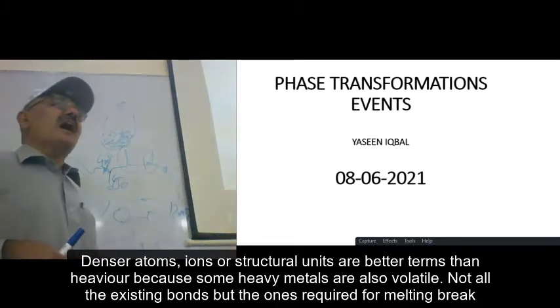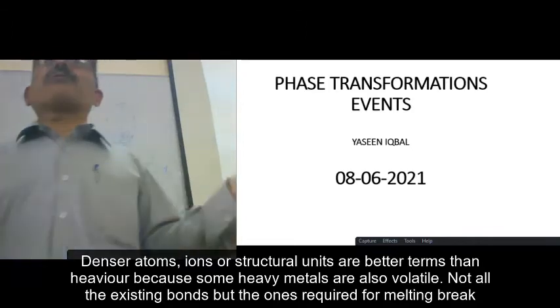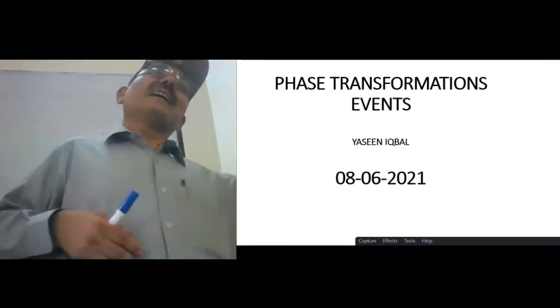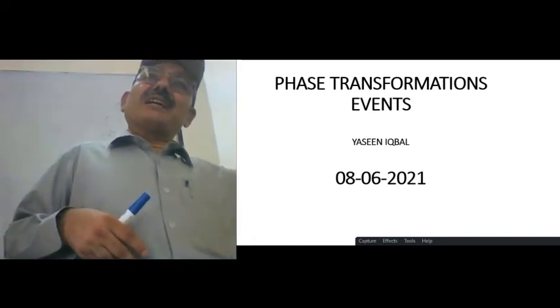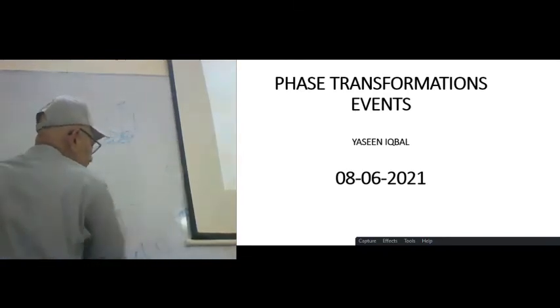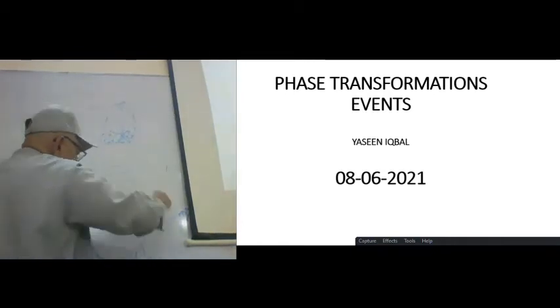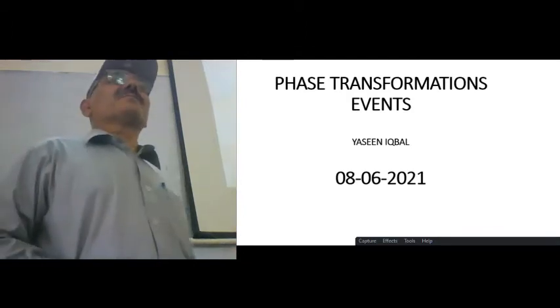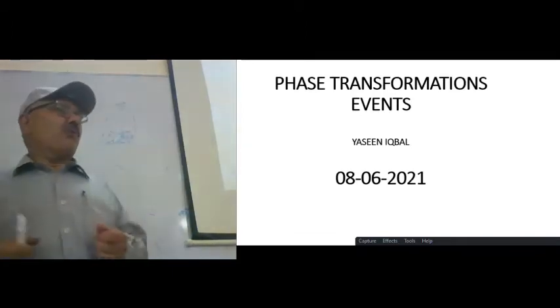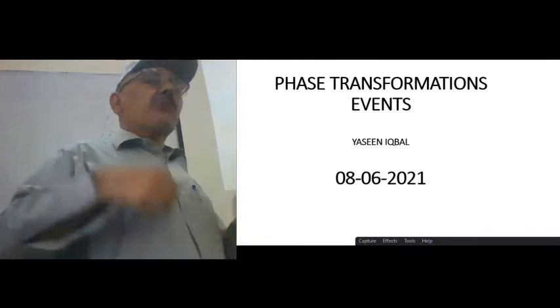Now, I did it. I combined different sorts of materials, and it was a glass former, and it formed a glass. But how do I know it is a glass? XRD. Take it to XRD. If it gives you an amorphous hump, this is glass, right? Now visualize it. Why are we getting an amorphous hump? Why not peaks? And what is glass?